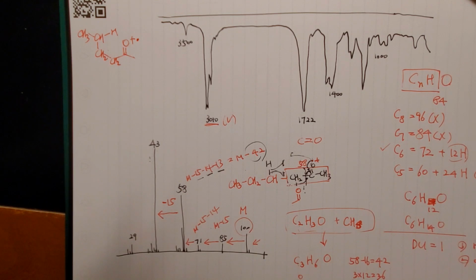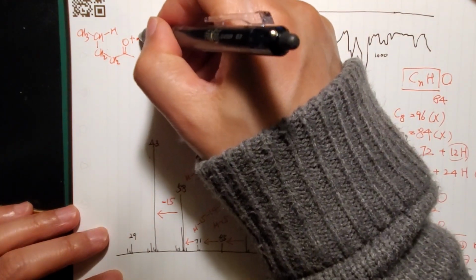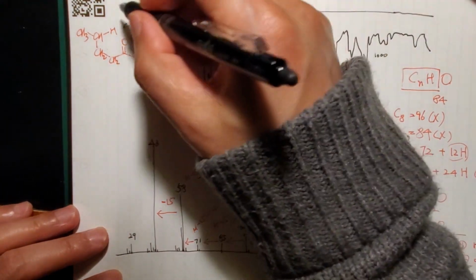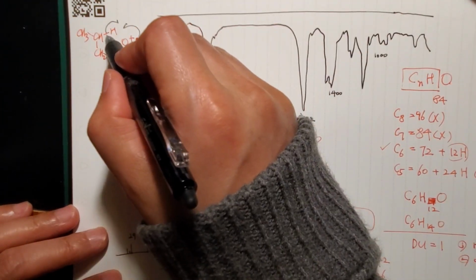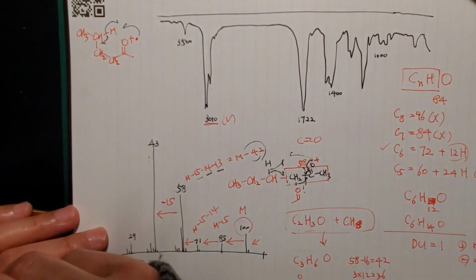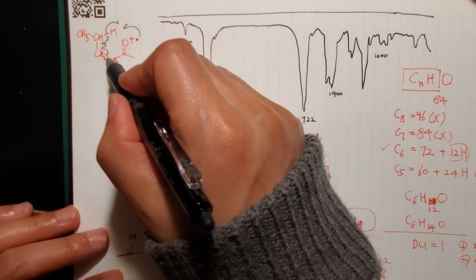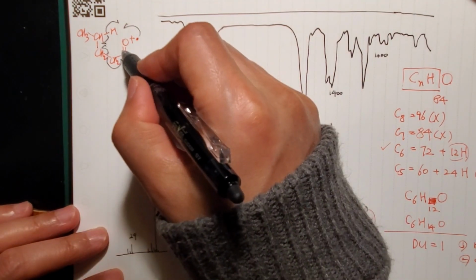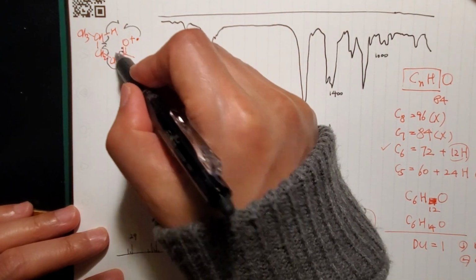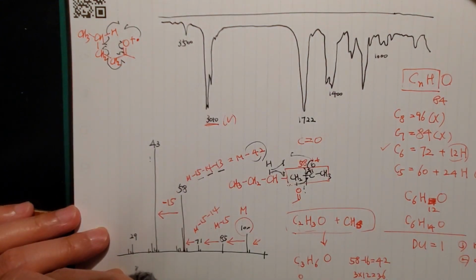You see the oxygen radical. That oxy radical now is abstracting hydrogen, the gamma hydrogen. Then one of these electrons goes there, bringing in this one. Then this one goes to the double bond area, and this comes into the double bond area, and that goes to the radical. We form the radical.